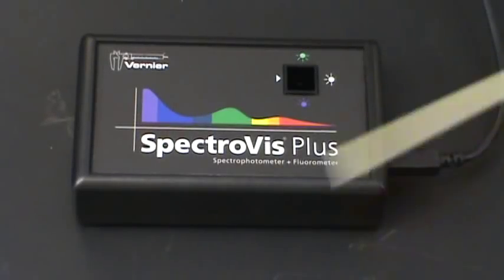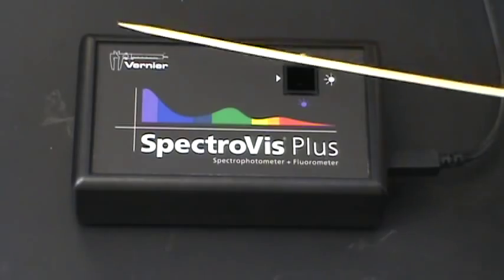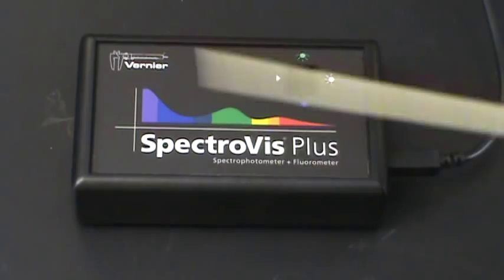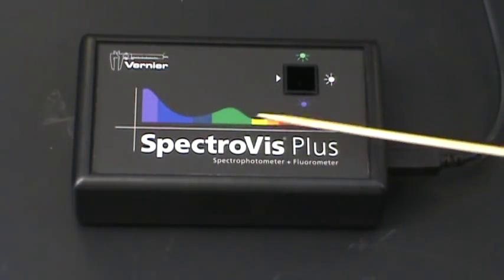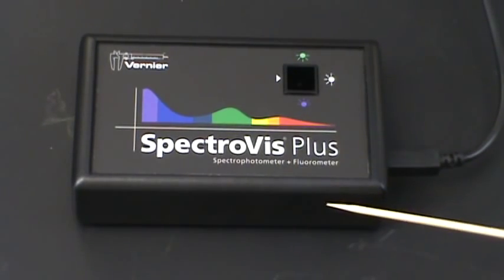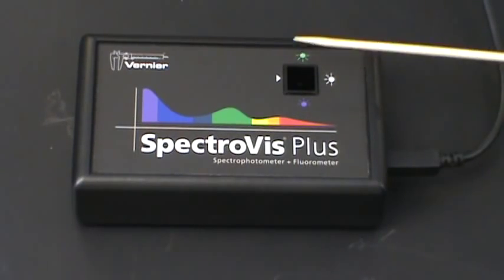Here's the SpectroVis Plus. This is the spectrophotometer that we're going to be using in lab. As far as instruments go, there isn't a whole lot here to worry about. There aren't any switches or dials or settings on the instrument. All we really have is a sample holder and a whole bunch of technology that's inside the box and does all of its work without us really doing anything to it. So if we look at the sample holder, there are a couple little pictures here that tell us what's going on inside that sample holder.